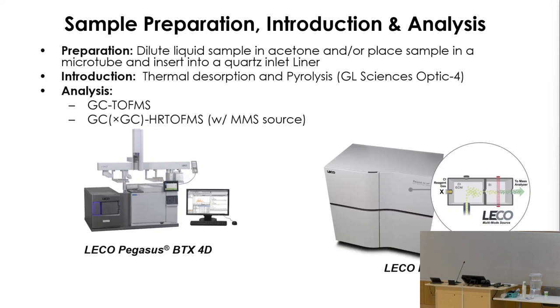As far as sample preparation, it's very easy. I try to stay away from manipulating the sample too much, so it's either dilute and shoot, as I did with liquid samples, or I did thermal desorption, followed by pyrolysis in separate steps.